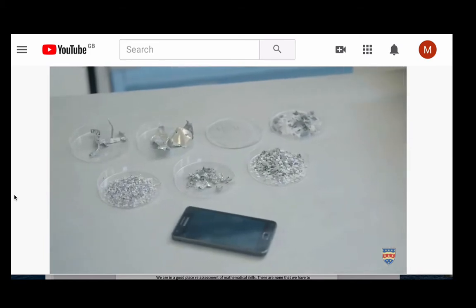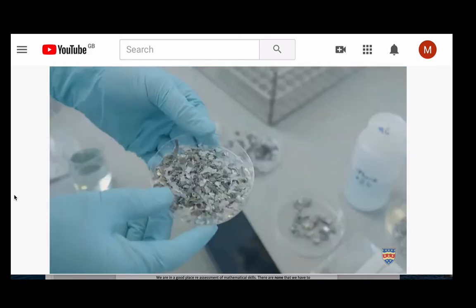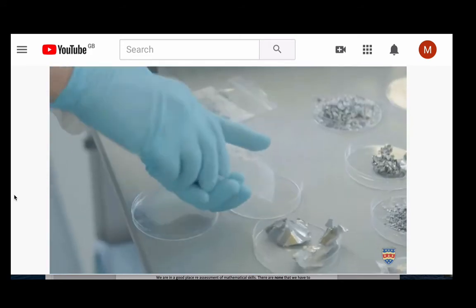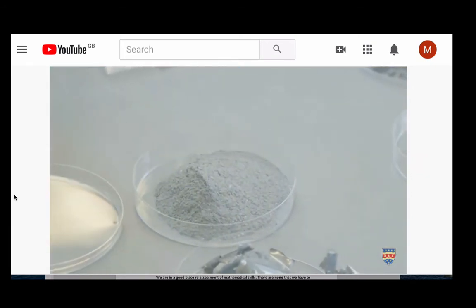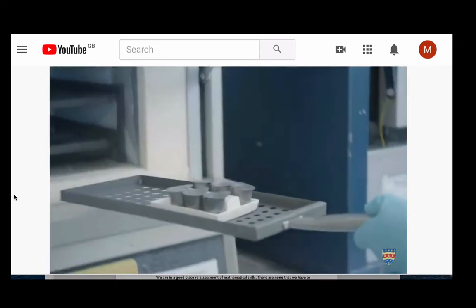This is our phone. This is what we got when we put that in the blender and I separated it into different fractions. There's some coarse bits here, some bits of plastic here. What we're interested in here today is actually this powder, the very fine powder, and that's what I've put in the crucibles and in the oven behind me. So let's see what we've got.